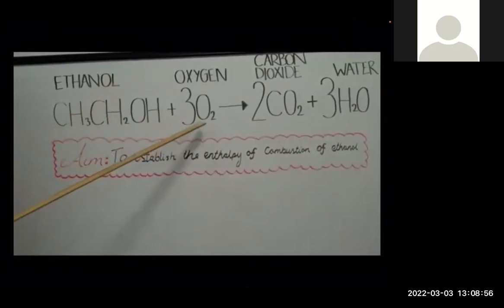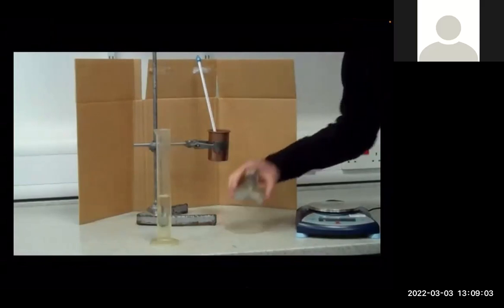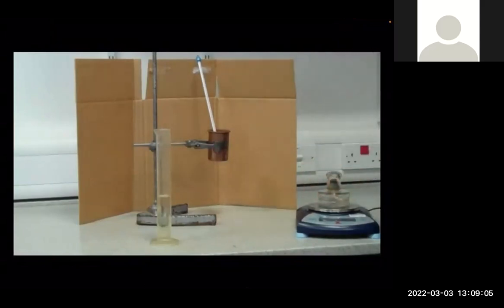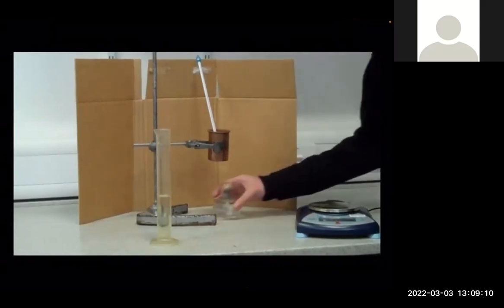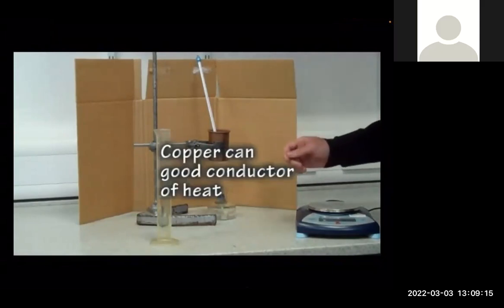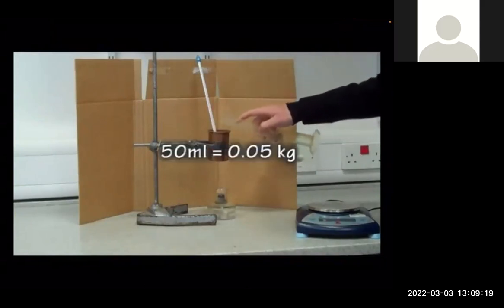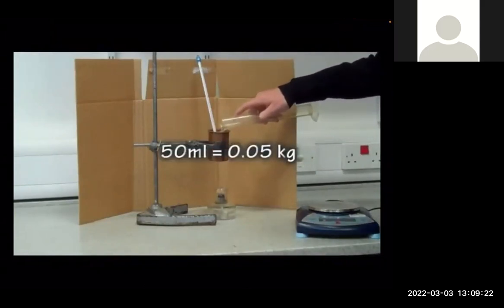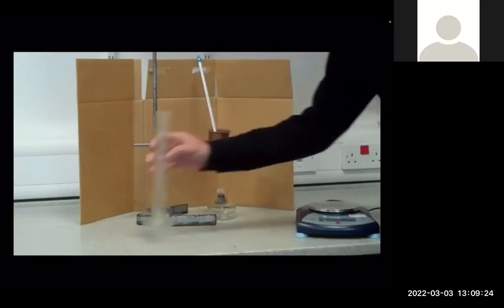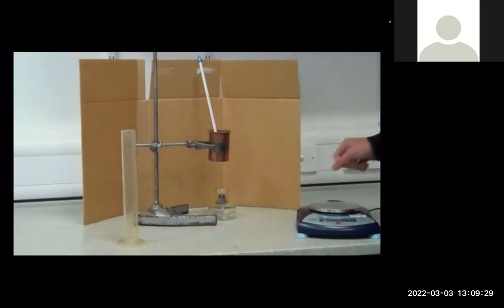It's very important that the equation has to be balanced. We begin by weighing this ethanol with the lid on, then place it under the copper can. A copper can is used as it conducts heat. 50 centimetres cubed of water, which is equal to a mass of 0.05 kilograms, is added to the can. We wait until the temperature settles, then record the start temperature.